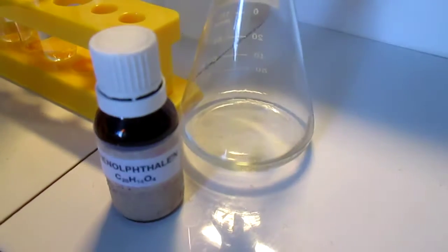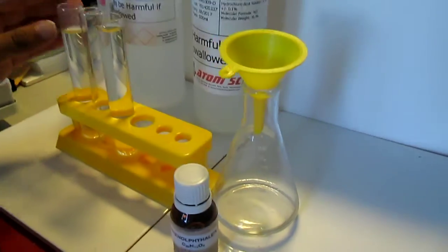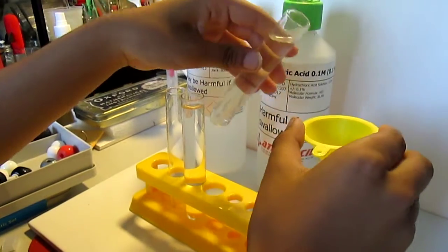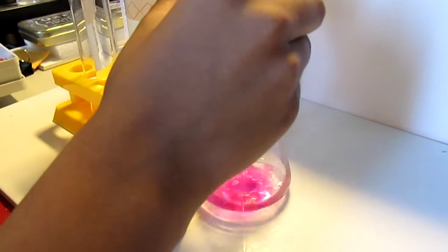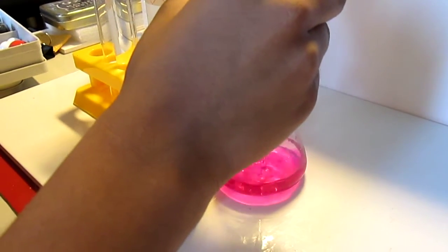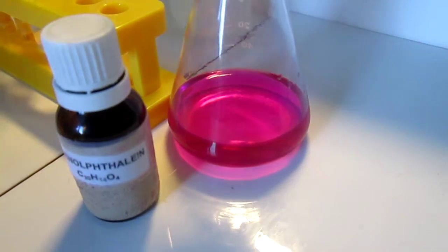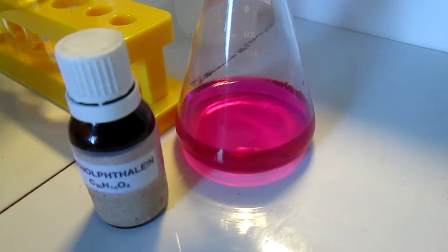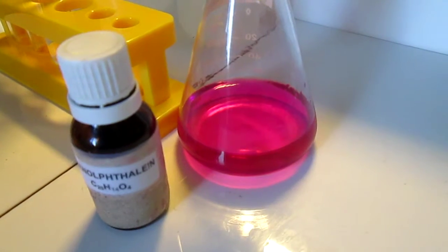We then pour a little phenolphthalein into the flask. You can see that the solution immediately turns pink. Phenolphthalein turns pink in alkaline solutions.